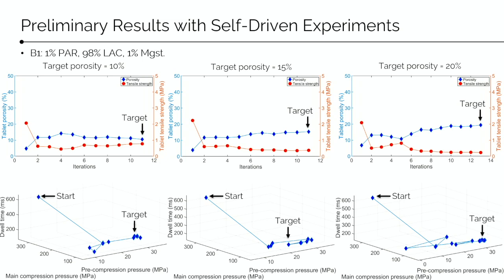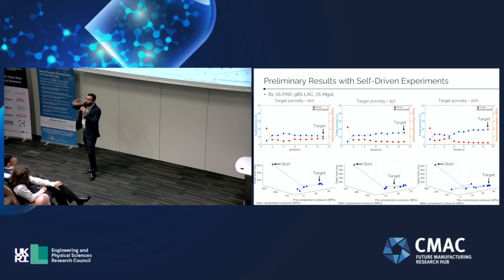Okay, that's a very valid point. So again, we have another PhD, Alex, who's working on this. He's working on models in which he takes all the scans of the raw materials, preparing a model that can perhaps predict the spectrum for the potential blend.